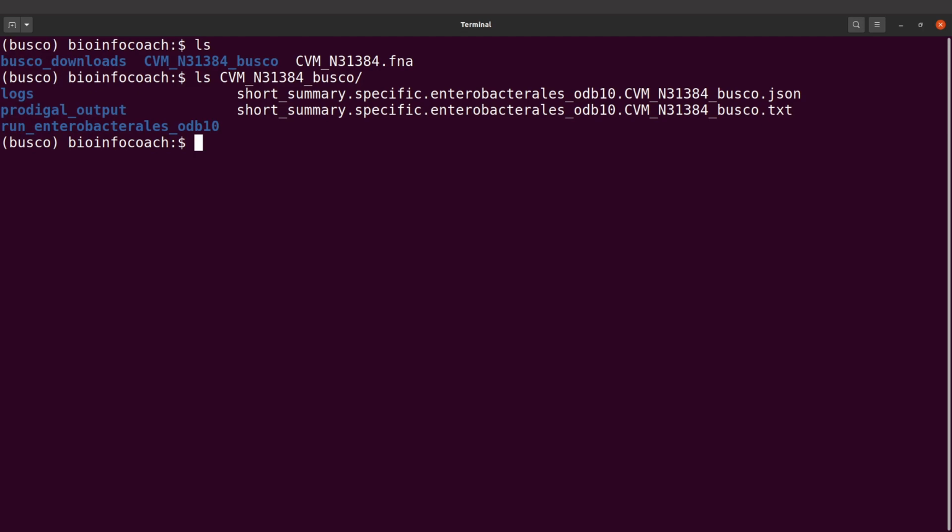Also, if you're dealing with multiple samples, then you need to write a bash script to automate the process. If you have lots of samples, maybe 10, 20, 30, 50, or maybe hundreds, then you can write a bash script. If you have a challenge, you can always contact me, book a session, and we can go through all this together and get your analysis done. So just make sure to do that.